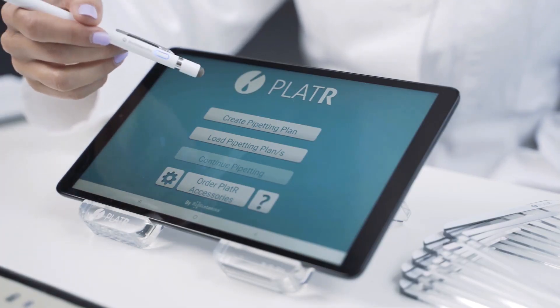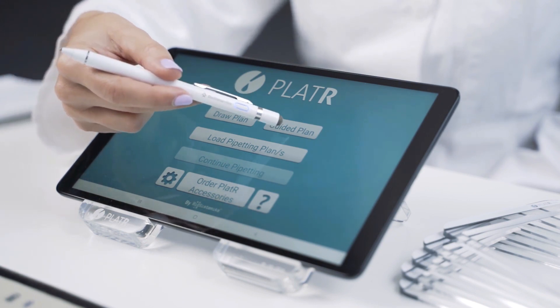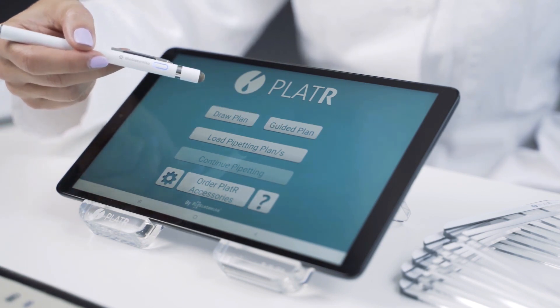First, you need to create your pipetting plan. You can make it from scratch, use guided plans, or upload an already existing plan.